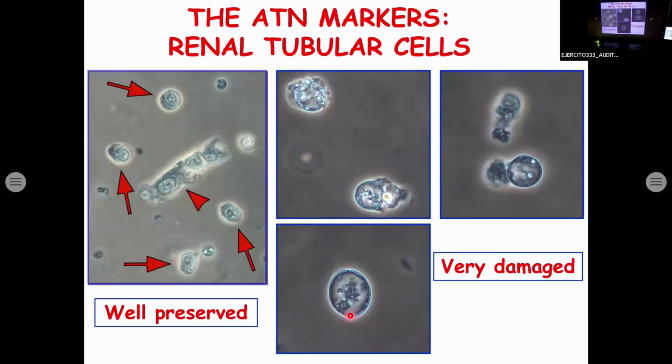Here I show you the ATN markers. Here we have renal tubular cells well preserved.